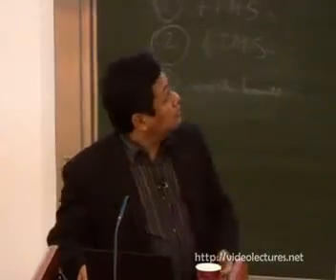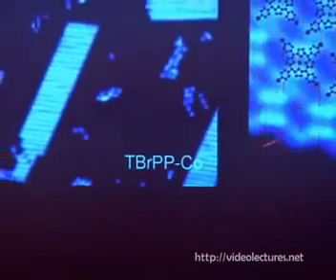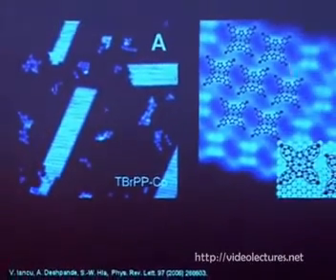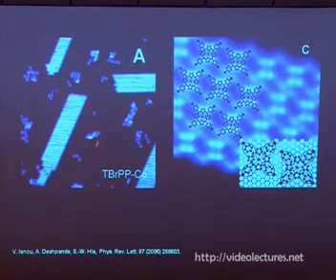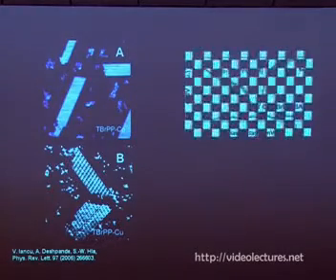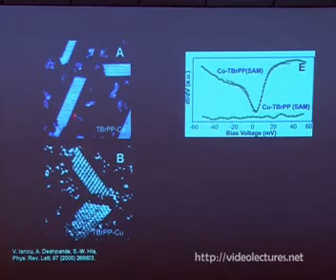So we move to the next step, where we start forming molecular layers. It turns out that we can form ribbon-like structures from the molecules. If we look at the structures, it appears that the molecules form a kind of hexagonal arrangement here. Unfortunately, only the flat ones form this hexagonal structure, while the bent ones stay without forming a structure. Again, we measure the Kondo effect. We use both cobalt molecules and copper molecules. They both form layers; this is the cobalt, this is the copper. Again, we measure the Kondo effect on one of the molecules in the layer. We see the Kondo effect in the case of cobalt. We don't see anything in the case of copper molecules. We confirm that, okay, we have a Kondo effect. It's nothing new.